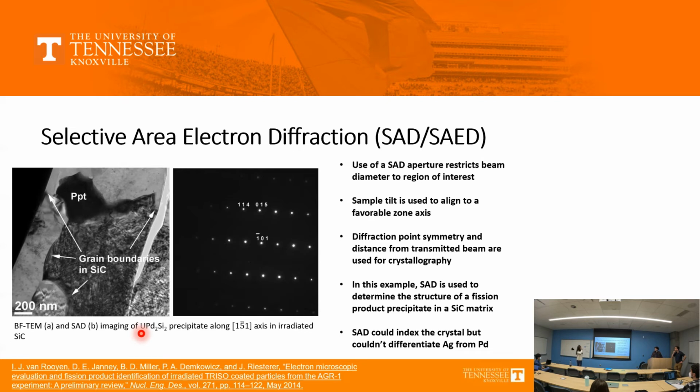Pretty obvious, right? For example, you have a precipitate. I call it sometimes the dirt, the dirt kind of a thing which is present on your clean matrix. Now you want information only from this area, not from anything here and here. To do that, we are constantly using two terms. One is selected area, and the other is convergent beam.